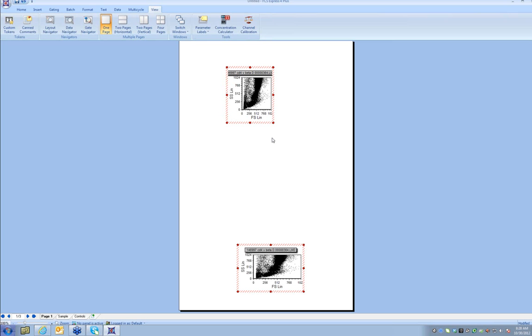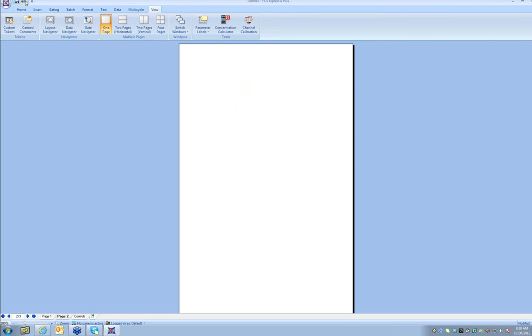And then if there's anything that you did that you didn't want to do, you can always go back and undo. The undo button is located in the exact same place it is in Microsoft PowerPoint, up there in the top left corner, or Control Z. You can go back and undo your changes all the way back to the beginning of your analysis. Okay? So again, that undo applies whether you change gates, whether you change plots, whether you change quads, markers, anything that you do in the software can be undone.